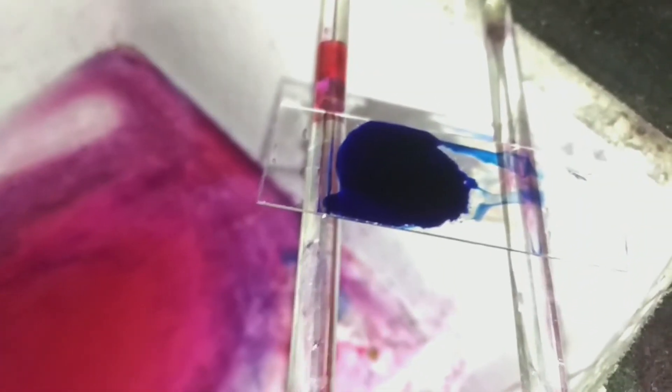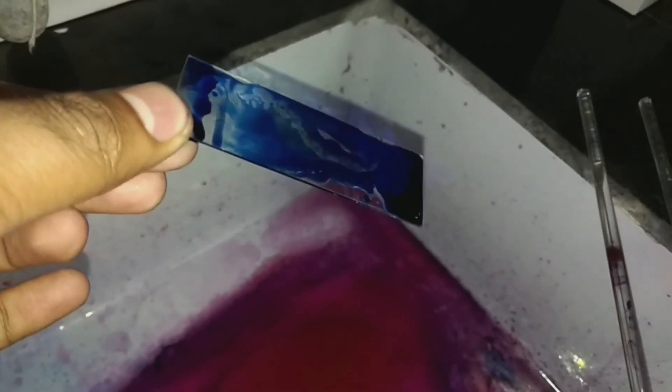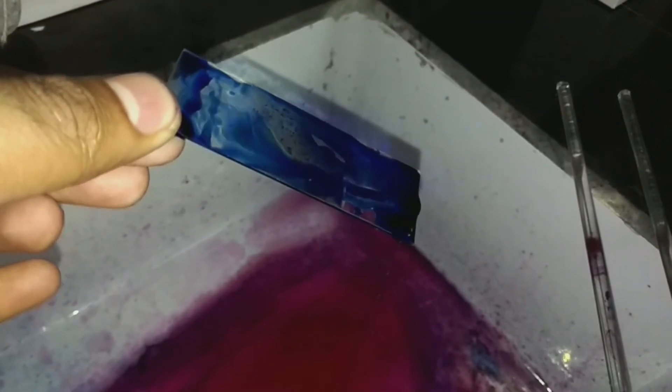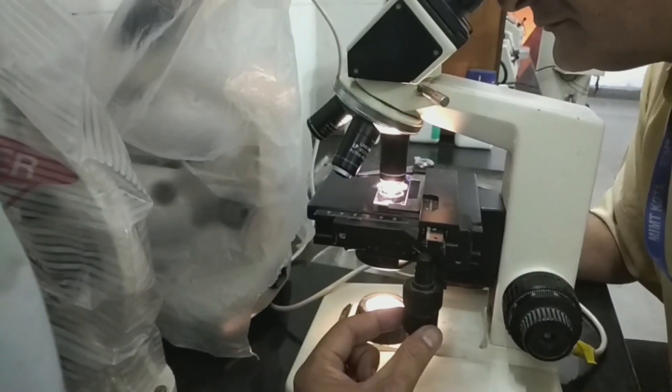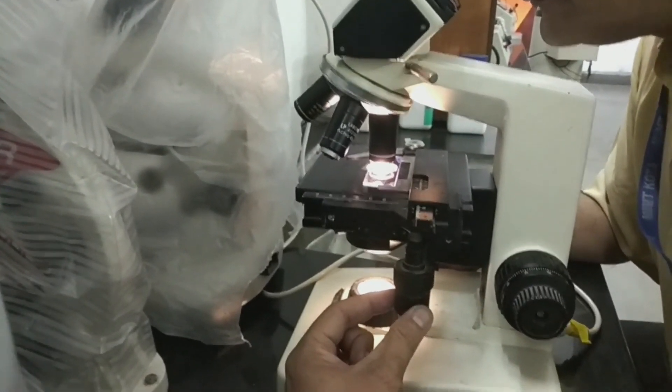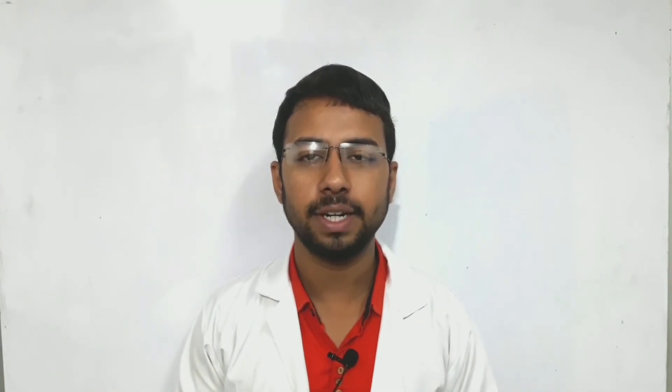Now stain the slide with methylene blue for one minute. After that, wash the slide again with distilled water or tap water. Dry the slide and examine it under 100x magnification with oil immersion on the microscope. You will see the bacteria appear reddish in color while the background appears bluish.